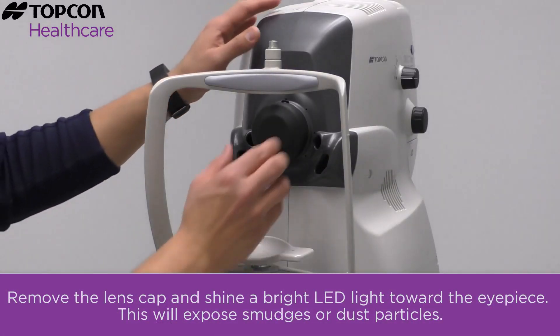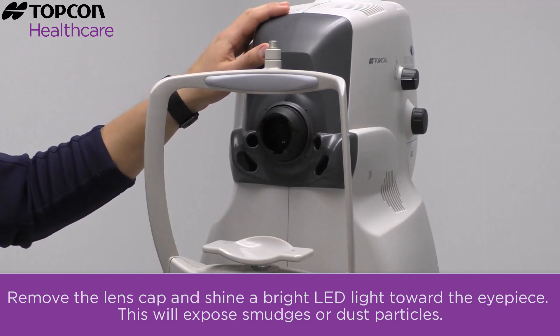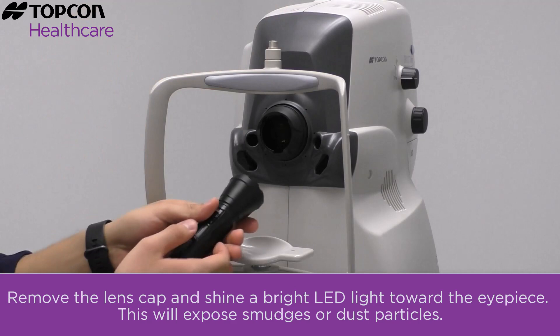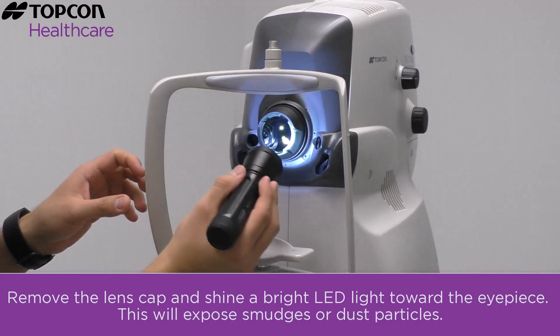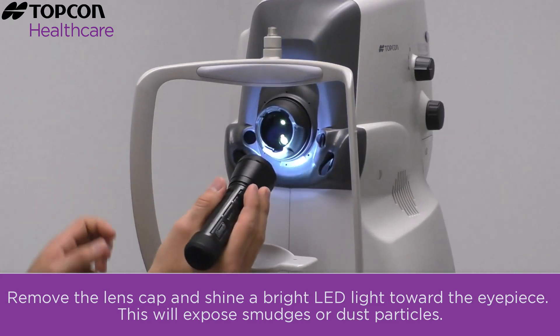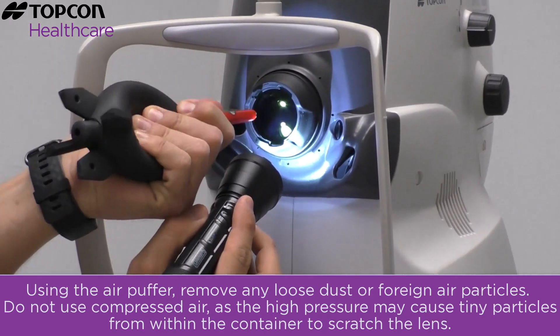To begin, remove the lens cap and shine a bright LED light toward the eyepiece. This will expose smudges or dust particles. Using the air puffer, remove any loose dust or foreign particles.